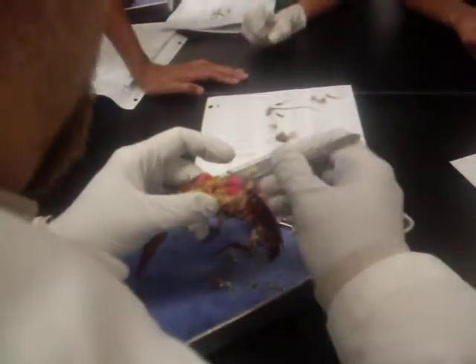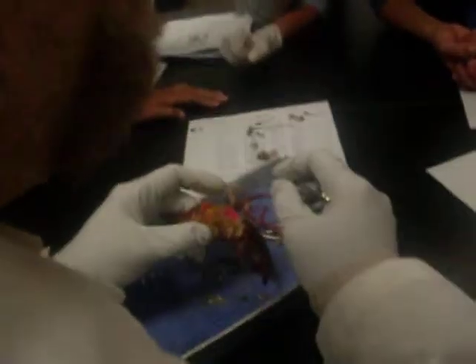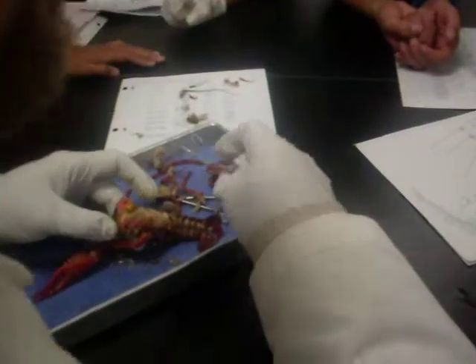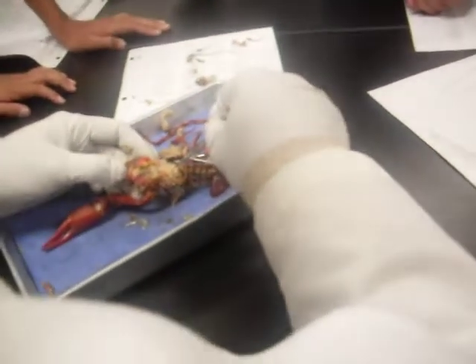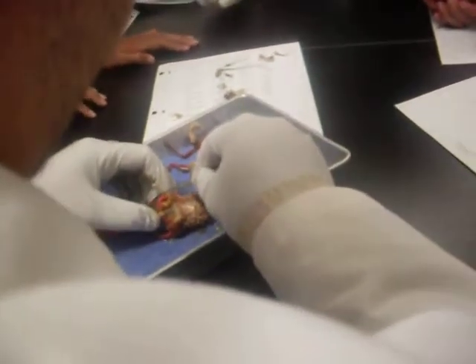In here — what do you think it is? Heart. Okay. Open or closed circulatory system? See how you don't see a lot of pink underneath? That's because it goes down and then there's nothing here, because it picks it up again over here.